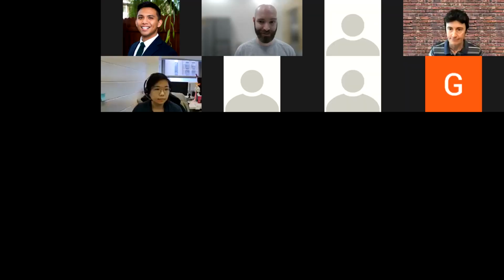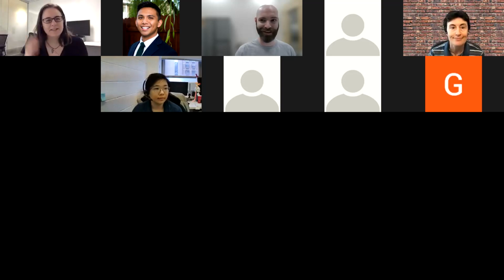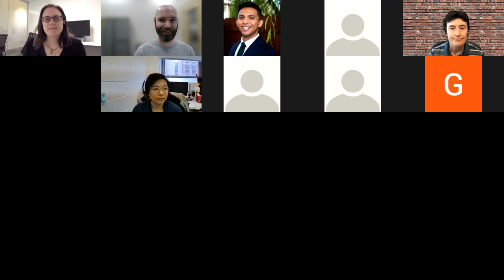Were there any more questions? Oh, I see Kim. Hi, I'm Kim from the University of Idaho. I'm curious if you could comment on how people are seeing issues with consistent amplicon dropout and consistent artifacts in the data generated by various library prep methods and sequencing methods.